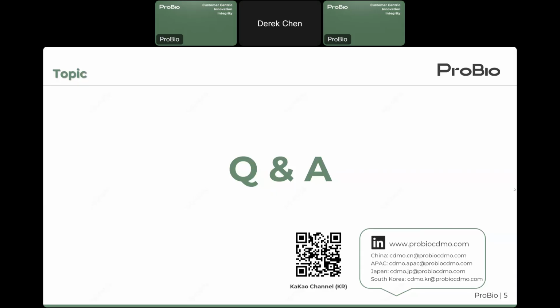And the following question is, which assay format do you recommend for the PK assay? As I mentioned in the presentation, anti-ID antibody with the sandwich ELISA is definitely the top choice.